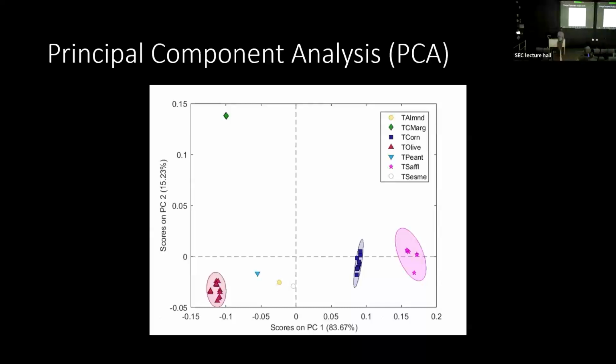This data set was put together by someone else, but I like it. They were trying to see how much adulteration of the olive oil with corn oil they could detect, because unscrupulous olive oil dealers were adding corn oil to dilute it because corn oil is much cheaper than olive oil. And they could detect down to like 5% corn oil, 95% olive oil. And about there is where the economics of faking your olive oil wasn't worth it. So they were happy with that.